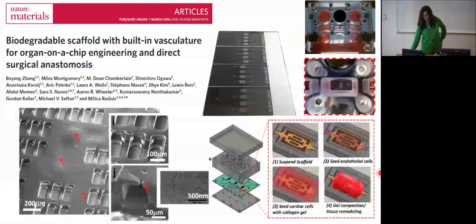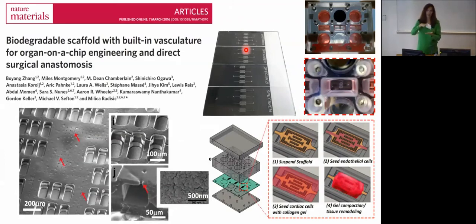And so Boyan makes this, and my other students also in the clean room, using this 3D stamping technique, where basically he will polymerize this polymer, which we call POMAC, layer by layer by UV light. He'll stamp into a PDMS mold a little bit of POMAC, transfer it to a glass slide like this, polymerize, peel off the mold, and make the next step, and so on. So it is a little bit labor intensive, but the good thing is it is scalable in the sense that you can do many of them in parallel, such as shown here.